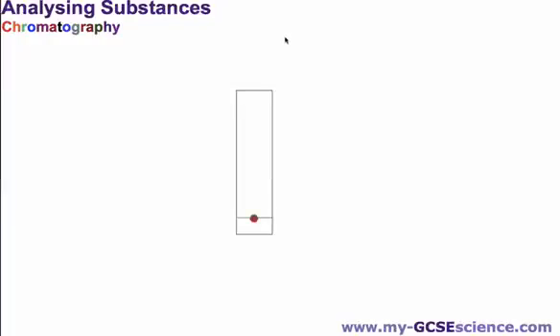Hello and welcome. This video is about analyzing substances, and we are looking at a particular method called chromatography. This is for Unit C2 for GCSE Science. So the method is paper chromatography, and it's a method that can be used for chemical analysis, and it's used to identify, for example, additives in foods. By additives, it could be something like artificial colors. Artificial colors can be detected and identified by this method called paper chromatography.